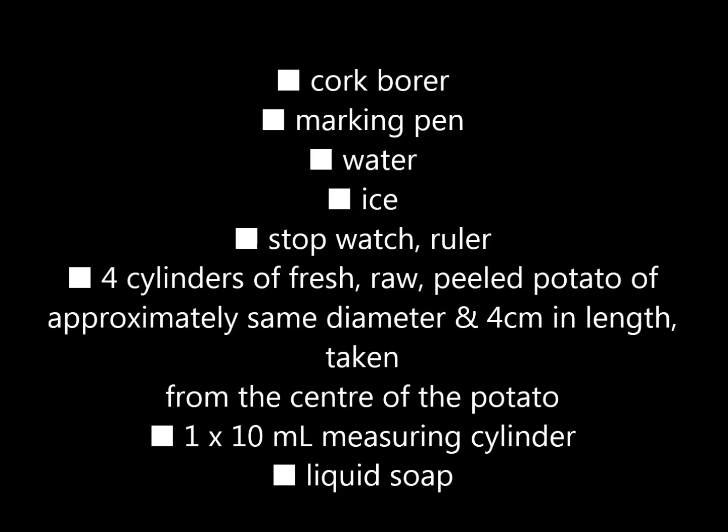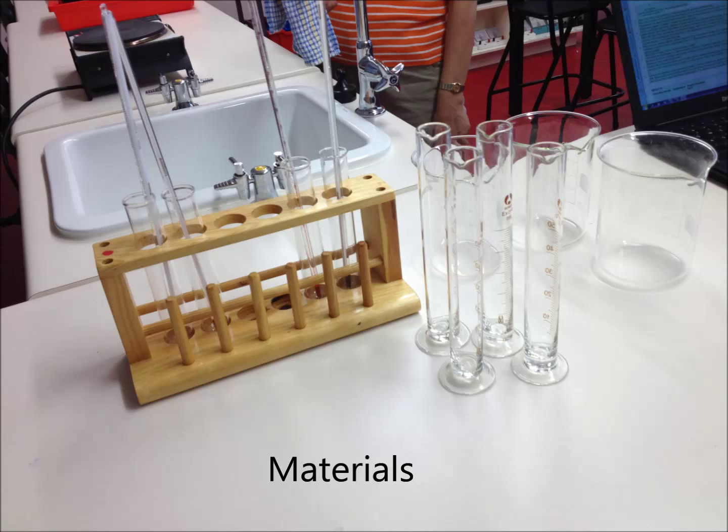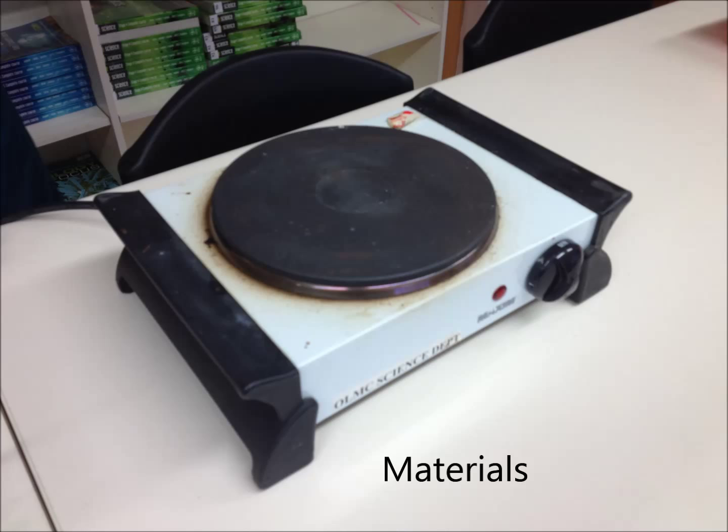You will also need a test tube rack, four thermometers, a cork borer, a marking pen, water, ice, a stopwatch, a ruler, four cylinders of fresh raw peeled potatoes, one 10 milliliter measuring cylinder, and liquid soap.